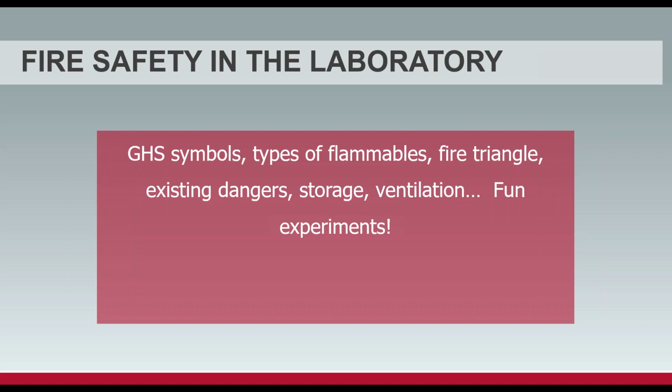We'll look at storage and existing dangers, and talk about ventilation, which traditionally is taboo. I'll tell you why, from my safety side, it makes a lot of sense to ventilate. Both exposure and flammability and explosion type safeties can all be done through that process. Most importantly, we'll watch a lot of fun videos together. I could talk to you for hours on safety, but I'm not going to do that. Since you guys are muted and can't interact, I figured we'll watch some videos together that drive home or discuss the points that I'll talk about as well.